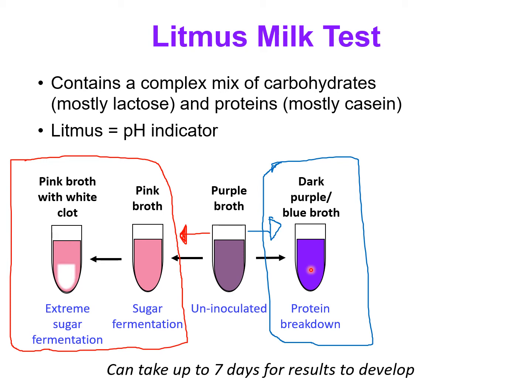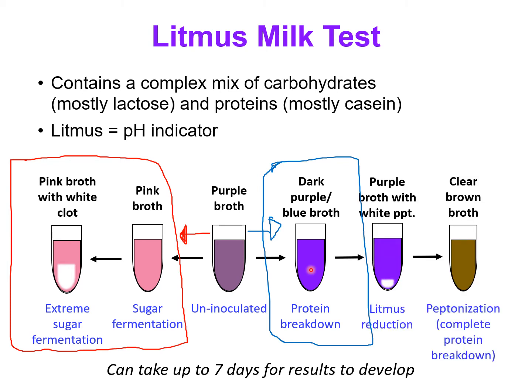What could happen if you incubate this broth longer? Well, then you can go through these results over here.